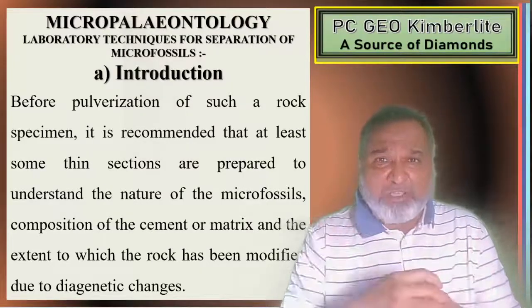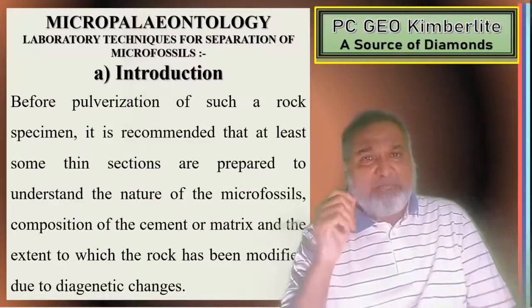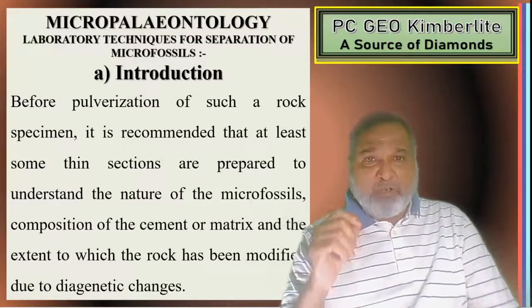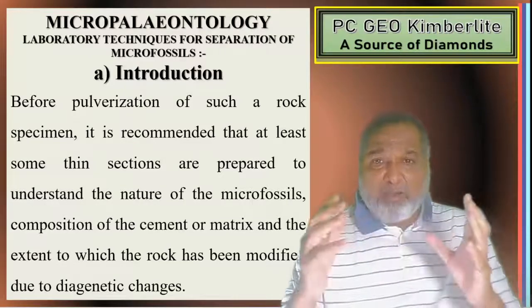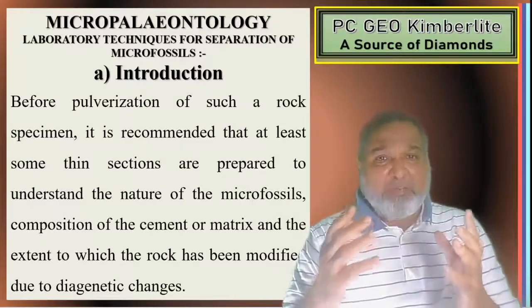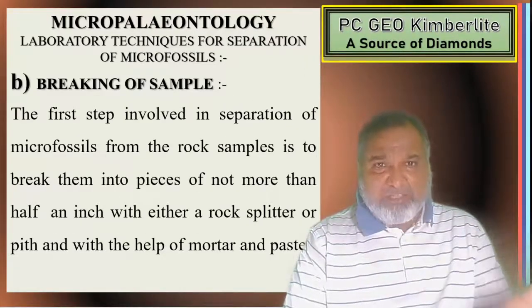Before pulverization of such a rock specimen, it is recommended that at least some thin sections are prepared to understand the nature of the microfossils, the composition of the cement or matrix, or the extent to which the rock has been modified due to diagenetic changes.